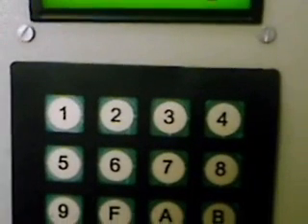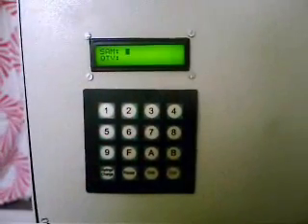After the power-on welcome message, press start on the keyboard and proceed to input the desired sample number and corresponding quantities. The white socket signifies sample 1.